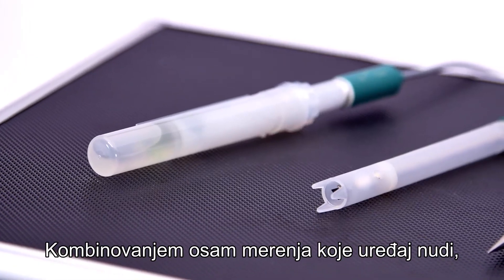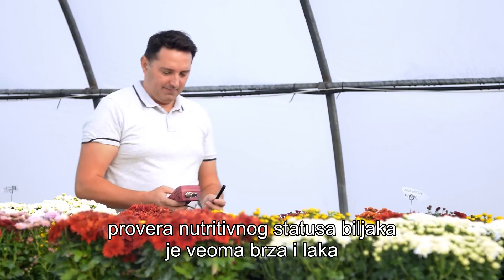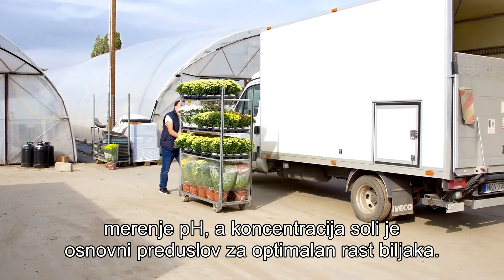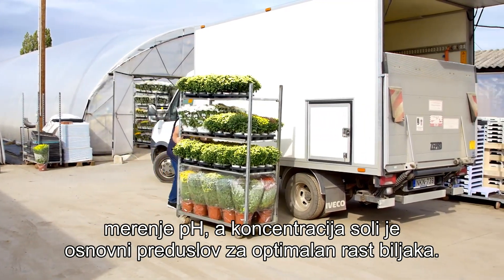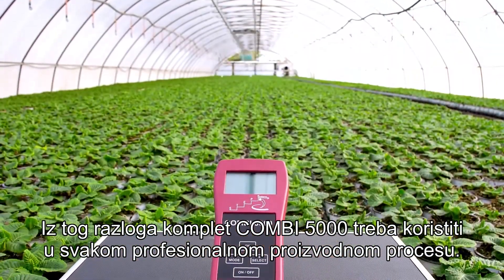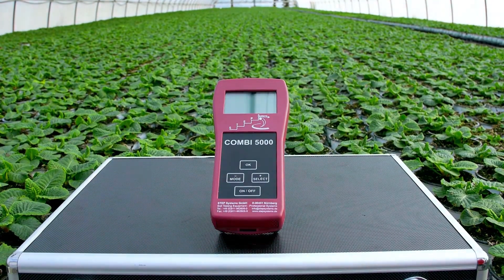By combining the eight measurements that the device offers, checking the nutritional status of plants is very fast and easy. The measurement of pH and the salt concentration is the fundamental precondition for optimal plant growth. For this reason, the COMBI 5000 kit should be used in every professional plant production process.